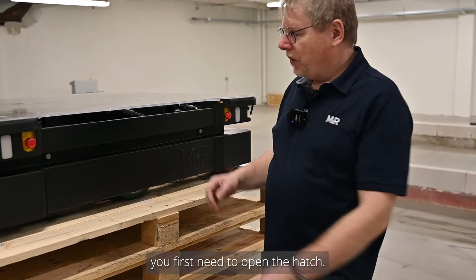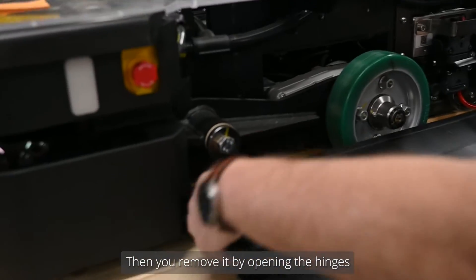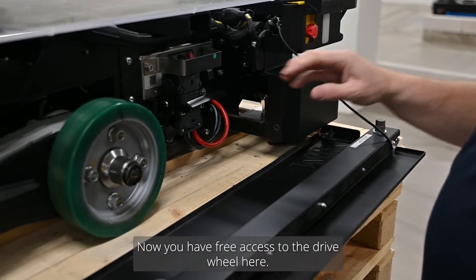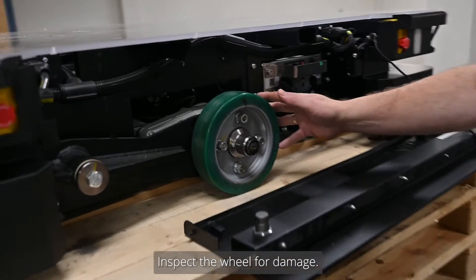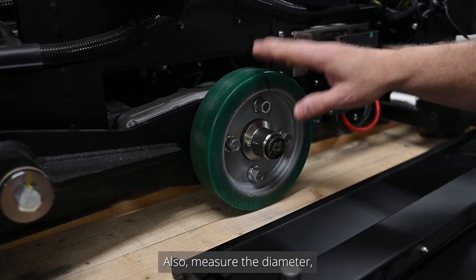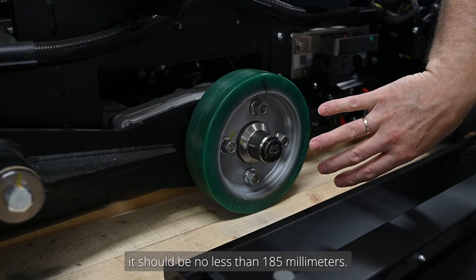To inspect the drive wheel, you first need to open the hatch, then remove it by opening the hinges at the bottom and put it to one side. Now you have free access to the drive wheel. Inspect the wheel for damage and ensure there are no flat spots. Also measure the diameter — it should be no less than 185 millimeters.